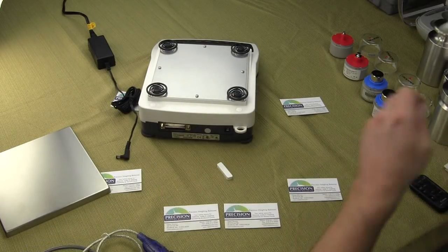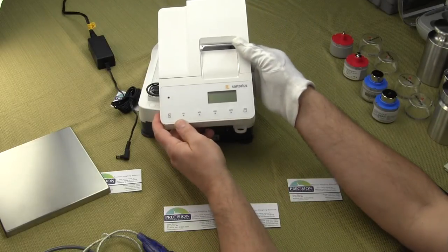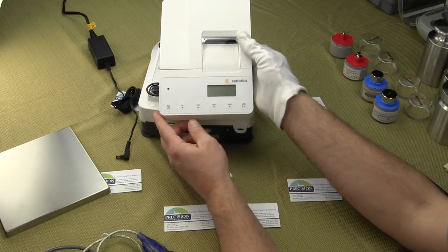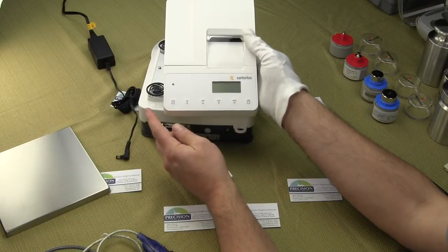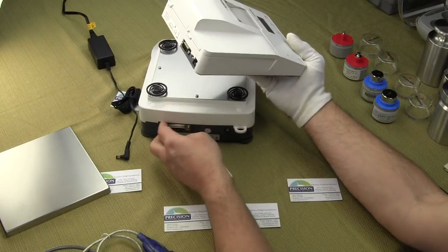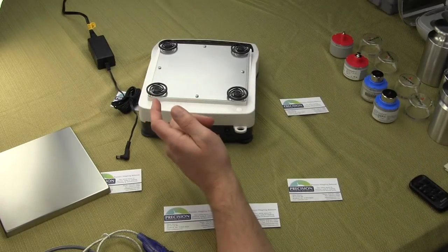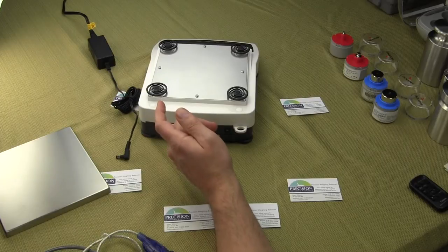If you are going to go with Sartorius' optional printer, which is right here — this is the YDP-20 OCE — when you buy the printer, it comes with the cable that would go from the balance to your printer.